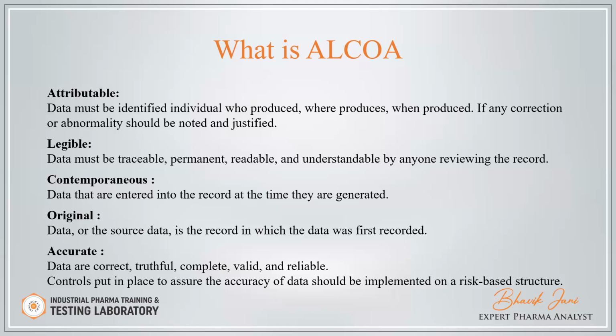Original data or source data is the record in which the data was first recorded. Whenever you record data, the first recorded data is the original data.